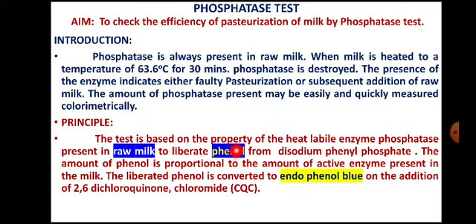Now presence of yellow color in the white colored milk is very difficult to detect, because with white color the yellow color contrast is not good. In order to detect the change in color, we need a dark color. That means there has to be increased contrast.